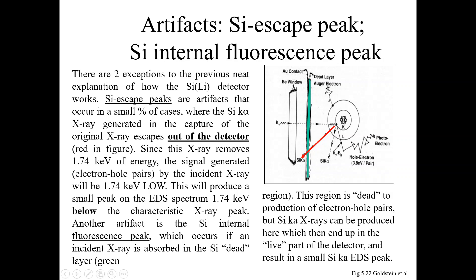The two exceptions are the artifacts known as silicon escape peaks and silicon internal fluorescence peaks. Escape peaks are artifacts that occur in a small percentage of cases where the silicon K-alpha x-rays generated upon capture of the original x-rays escape out of the detector — shown in red in the figure. Since these x-rays remove 1.74 kilo-electron-volts of energy, the signal generated by the incident x-ray will be 1.74 keV low, producing a small peak in the EDS spectrum 1.74 keV below the characteristic x-ray peak.